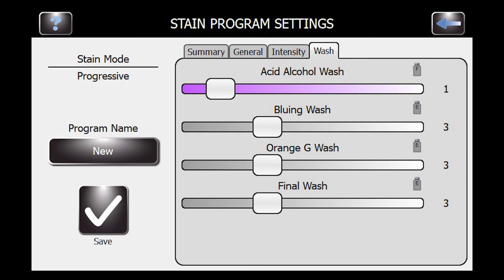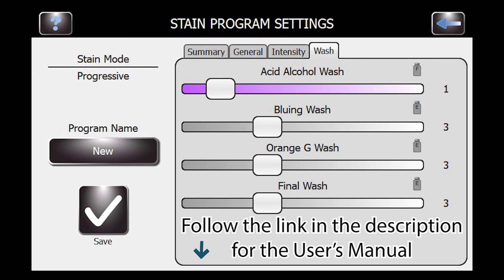That covers the 11 settings the machine has. Cleanliness is important — the acid alcohol wash is what you want to increase a little bit, and that varies depending on whether you're using regressive or progressive staining. I would read up on those to be familiar. The manual appendix has some really good information about each stain, the washes, acid alcohol, and how they work.